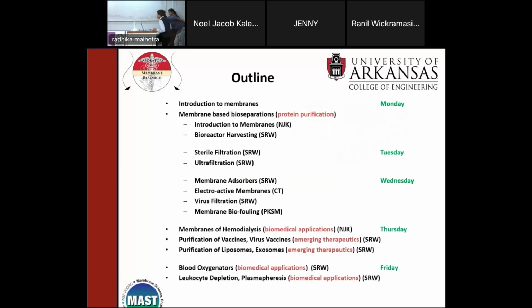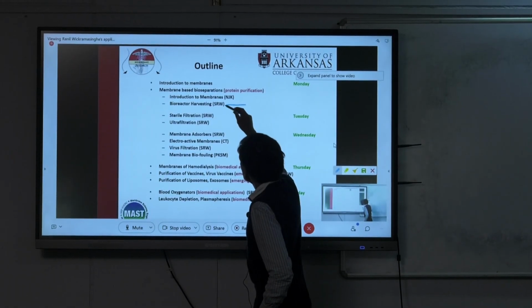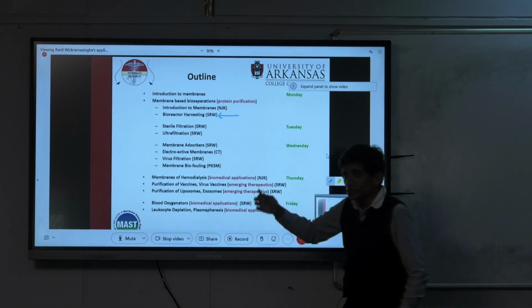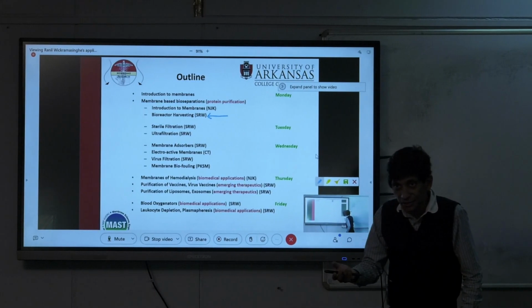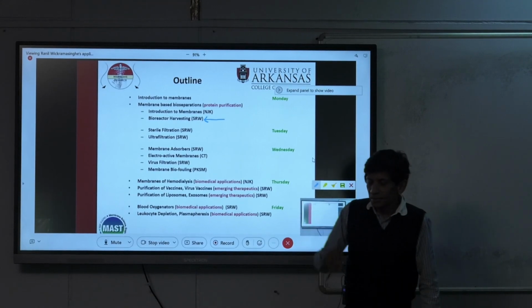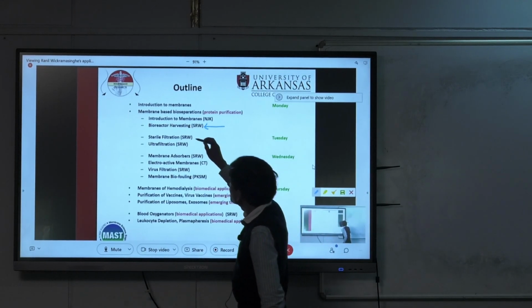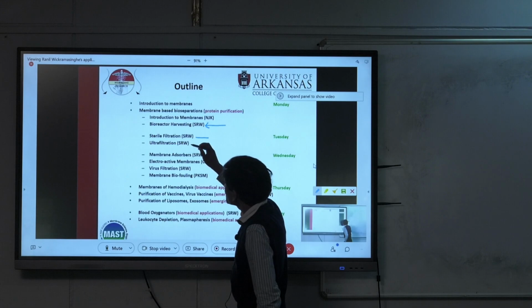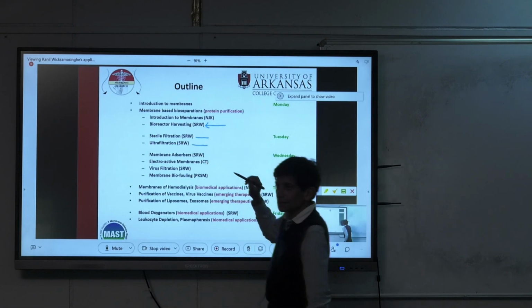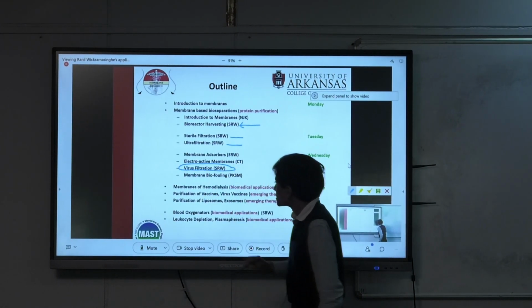All right, so just to summarize where we are, we've talked about these processes. So we're coming to the end of these pressure-driven processes. We talked about bioreactor harvesting, right? And we said that that could be tangential flow, and it could also be depth filtration, right? And there are some other things I'm going to talk about when we get to emerging therapeutics about developing methods. But in terms of what's established, we did those two. We talked about sterile filtration yesterday. We talked about ultrafiltration yesterday, right? And so now if you look at it, the only remaining one is virus filtration.